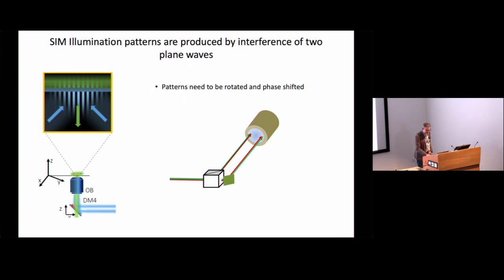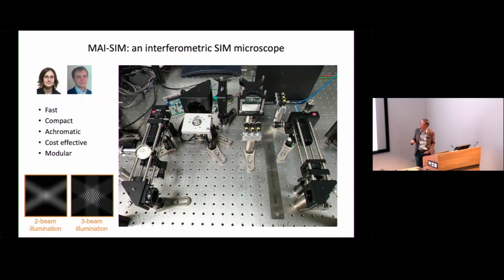And so this is where we came up with this idea. So this is the heart of the instrument that we've developed. So essentially, we use what's called a Michelson interferometer to generate these patterns, to split the beam into 2 parts. So physicists will here recognize the Michelson interferometer. So here's the beam splitter, that big cube. The laser beam comes in, and then is split into one beam this direction, and another beam in that direction. And then retroreflected, and that creates my 2 beams coming back. And they are then going towards the microscope and then interfere in the microscope.